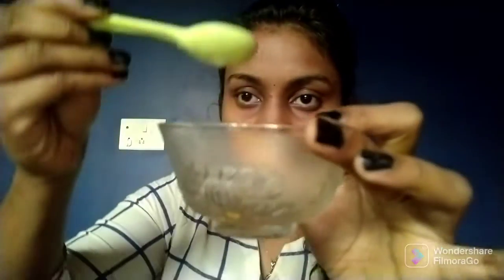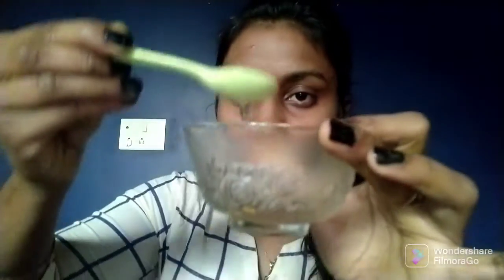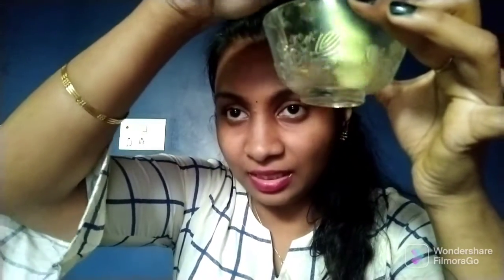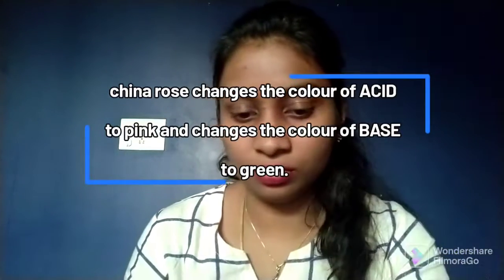It is not at all changing its color, right? Whatever color that solution has, it is not showing that color. It has neutralized the color of China rose.